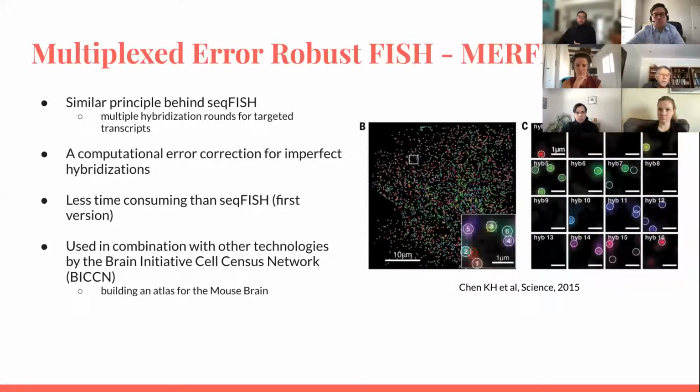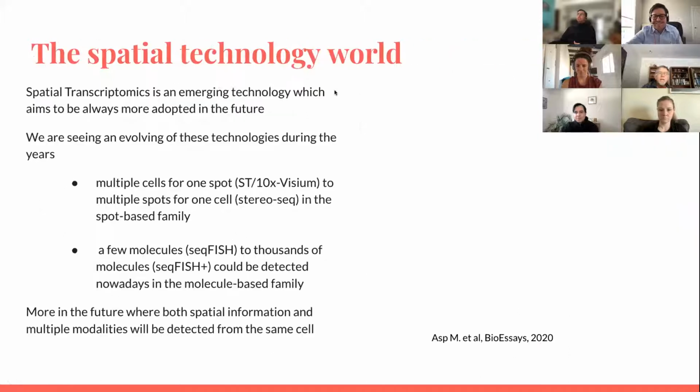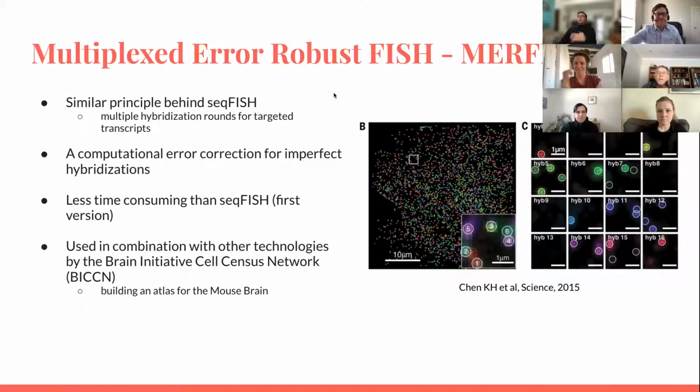For the MERFISH, the principle behind the MERFISH is very similar to the one behind the seqFISH.